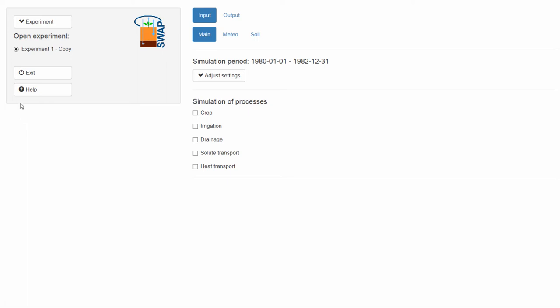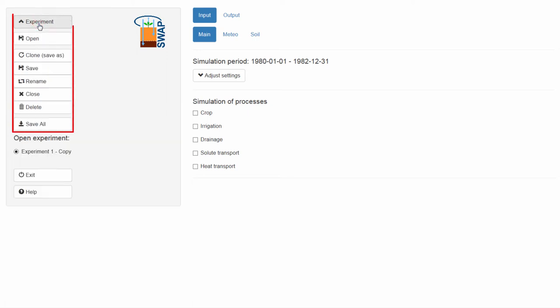In order to do this, you need to open the drop-down menu, Experiment. We already have an experiment open, so you see more buttons here than what you saw before.